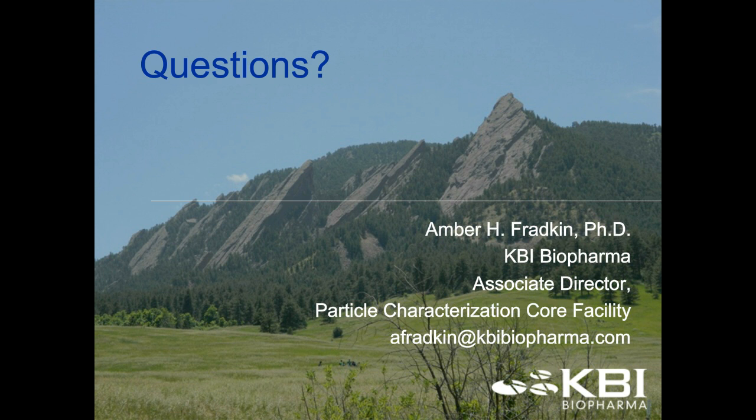Absolutely. That's one of the advantages we've seen. As I mentioned, a lot of emulsions or gels, ointments typically have relied on laser diffraction, but depending on the particle in that emulsion, we can certainly pick out the images quite nicely with the microscope.